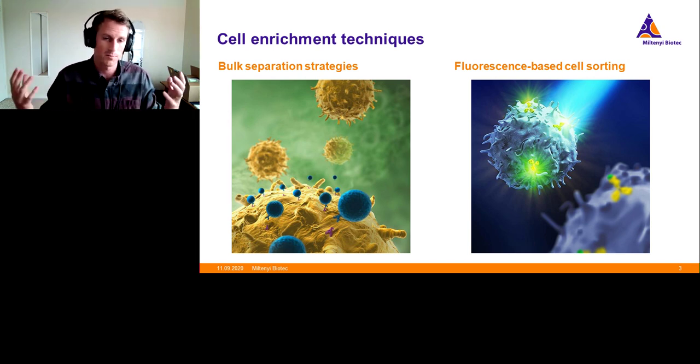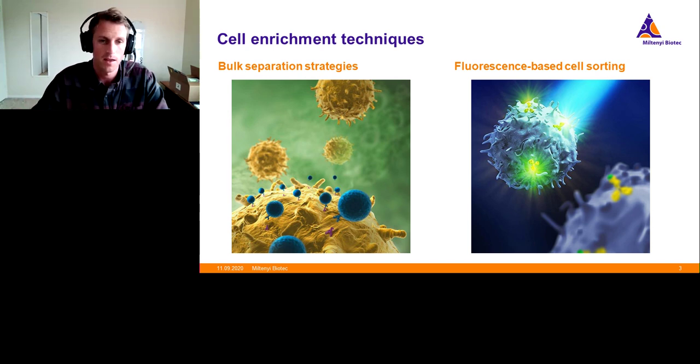So we can pull out specific cells from a co-culture and use those cells for downstream assays. And this is a pretty much ubiquitous technique now, and it's led to a pretty amazing advancement in clinical applications in cellular therapy as well, which is really quite exciting.